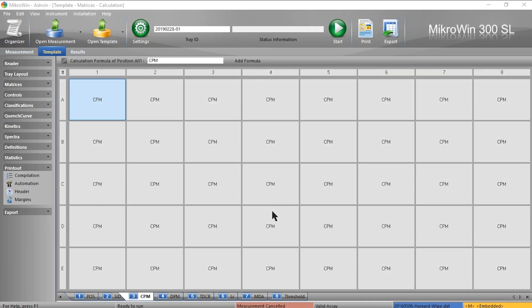In this video I'm going to show you how to create an automatic printout for your template in MikroWin, the software for the Hidex 300 and 600SL. Alongside the ability to automatically export each template and data file, you can automatically print out as well.